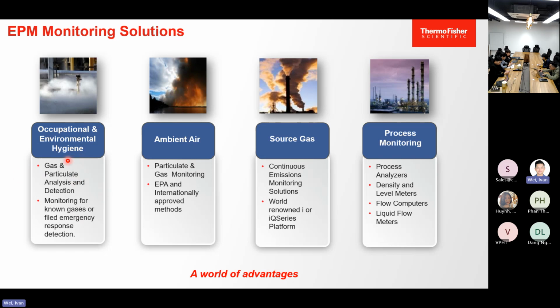gas and particulate matter. That's where we work closely with government agencies, EPA, MOE, Ministry of Environment, or some other universities that are interested in monitoring pollution: PM 2.5, PM 10, NOx, SOx. Those are for environmental monitoring. But at the same time, those applications can apply to ambient air monitoring and also source monitoring.